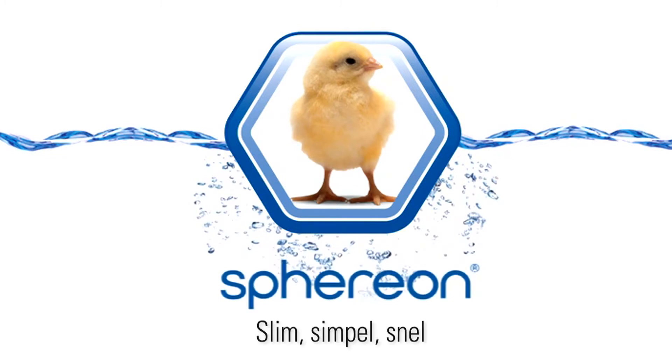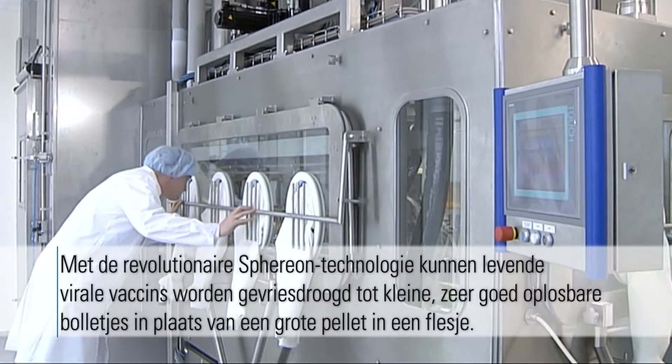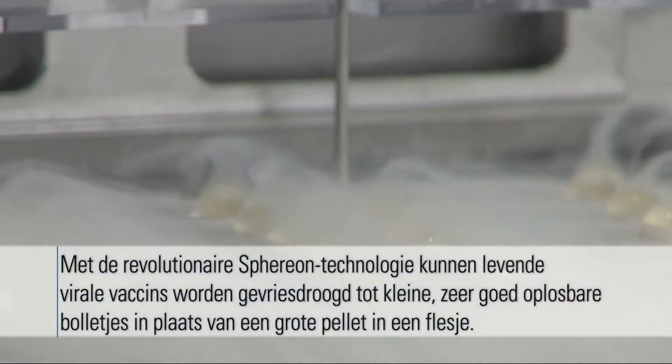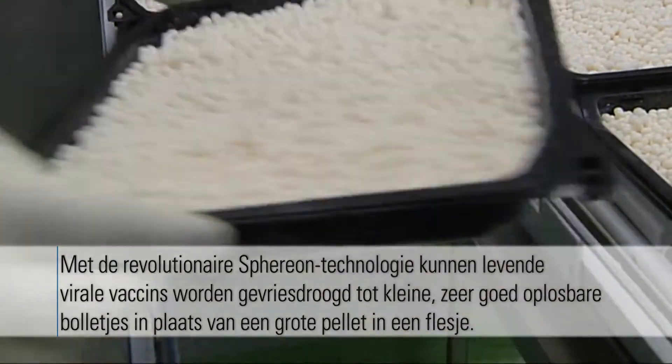Spherion. Smart. Simple. Soluble. The revolutionary Spherion technology freeze-dries live viral vaccines into small, highly soluble spheres instead of a single vaccine cake in a bottle.